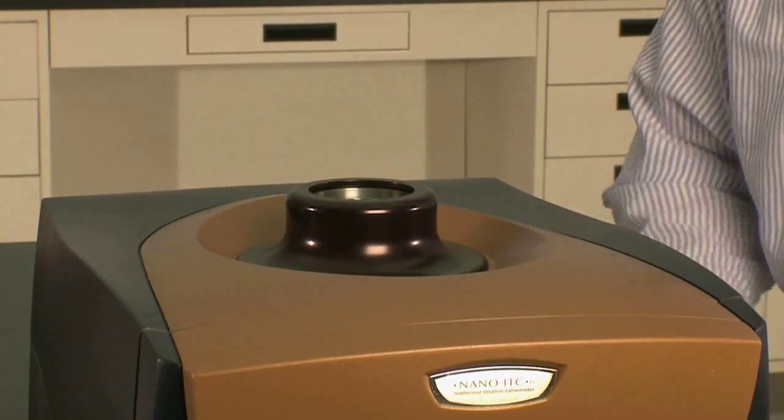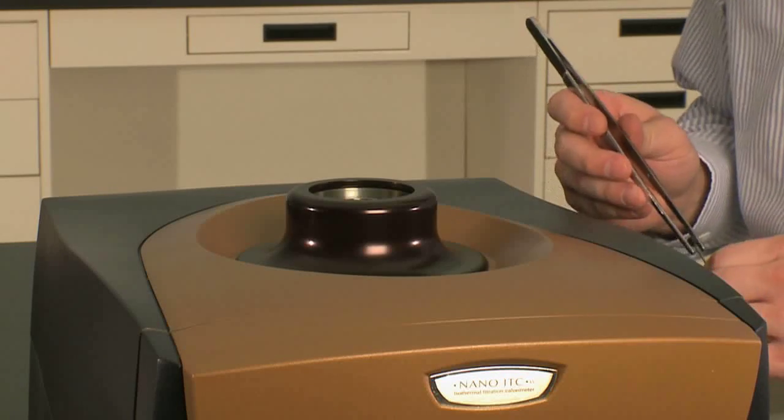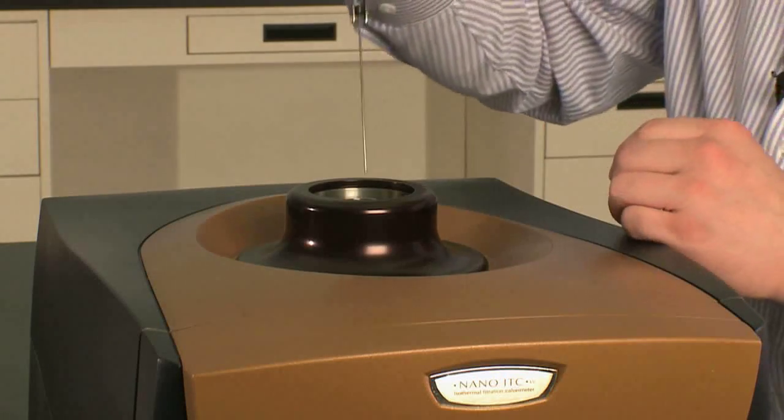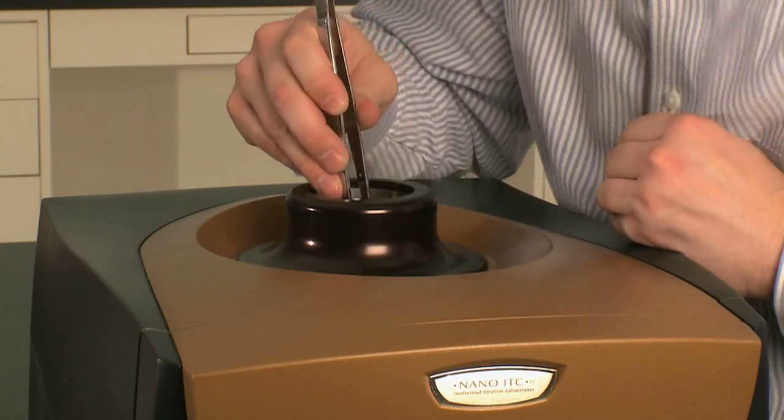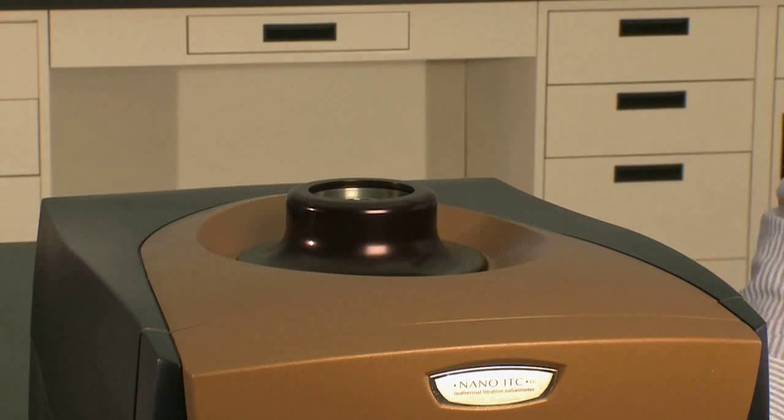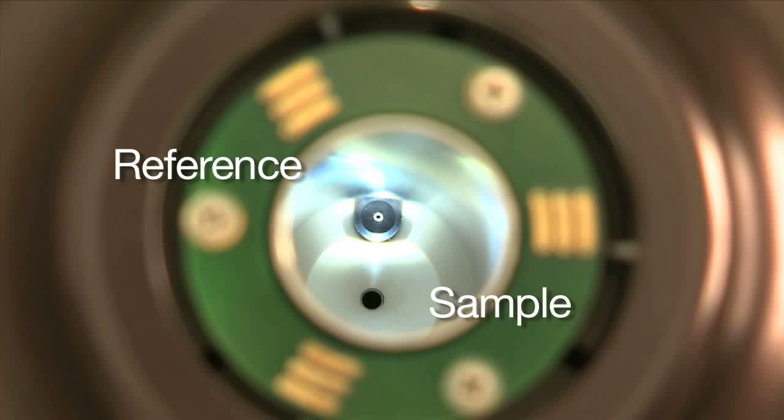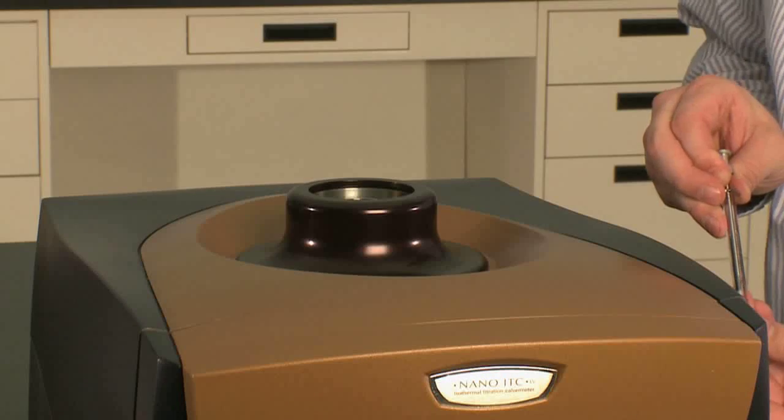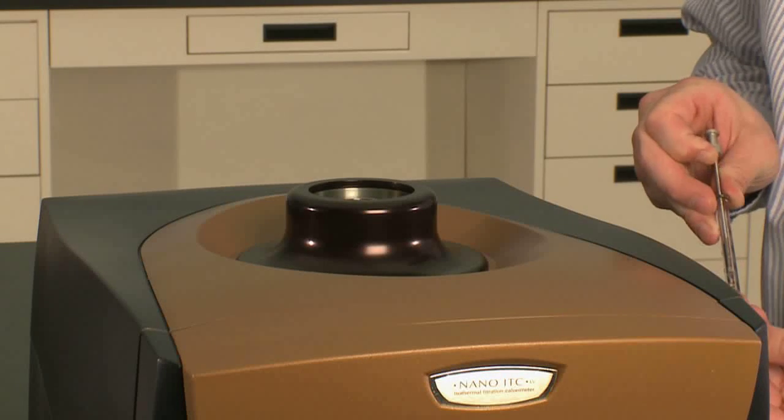Then I'll return the reference needle back into place. To fill the sample side, the sample side is located in the center of the ITC, and I'll use the same half milliliter syringe.